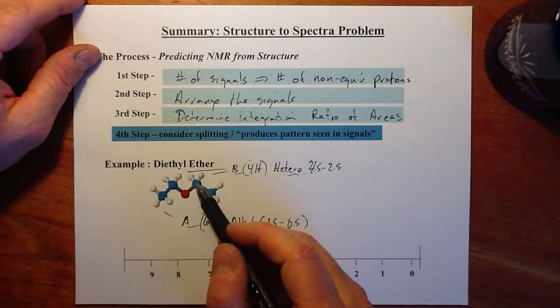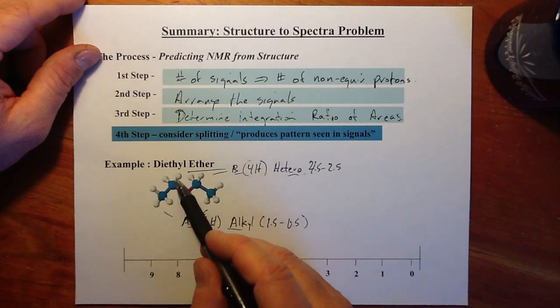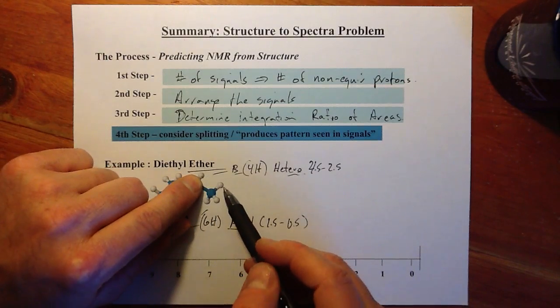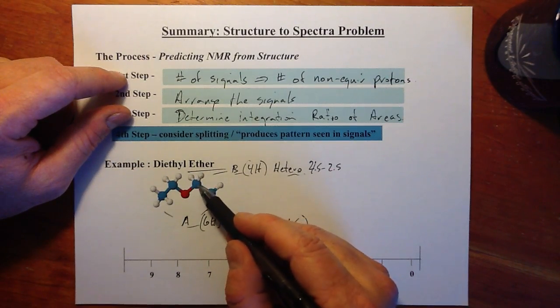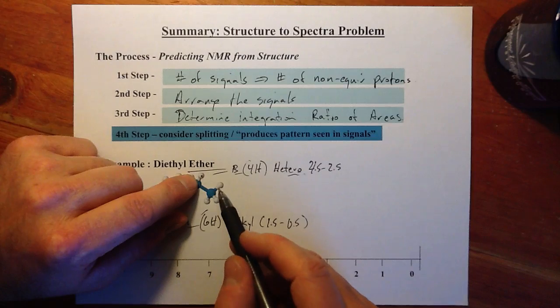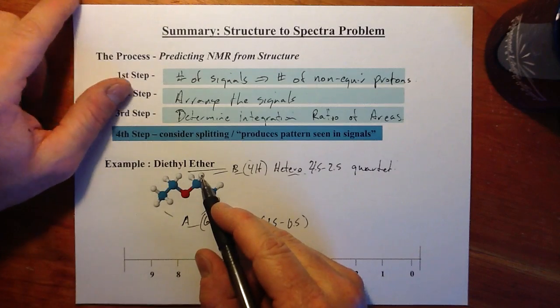And we take a walk. Now I don't consider the splitting of this one because these are equivalent. So I have to go to a non-equivalent proton. These carbons adjoin to each other. This one's the proton I'm looking at. This is one that's different. Now how many are different at that position? 1, 2, 3, off of an adjoining carbon to the one I'm focusing in on. This is my representative of B. Whatever's true for this one's true for all. He has 3 non-equivalent neighbors. So I'd expect a quartet for this proton, its signal.